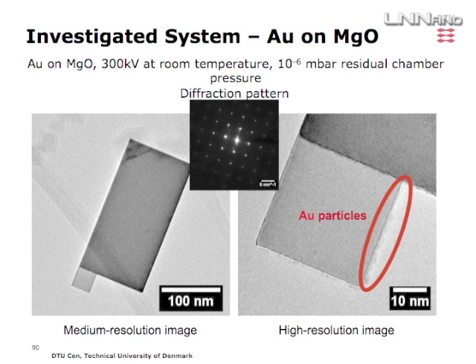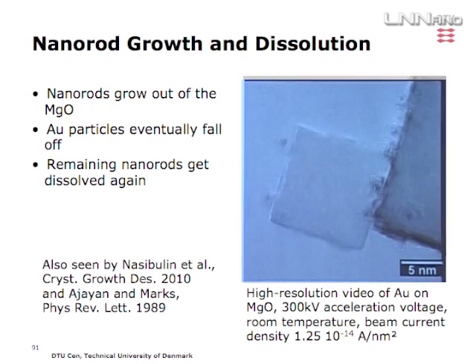Here we see such an individual cube. They turned out that they like to be brothers, so there was always a little one on top of a smaller one. And here you see we have deposited, it might not be so clear, we evaporated tiny gold particles onto the surface. You can see them as well down here. You can see that the cube is nicely aligned.